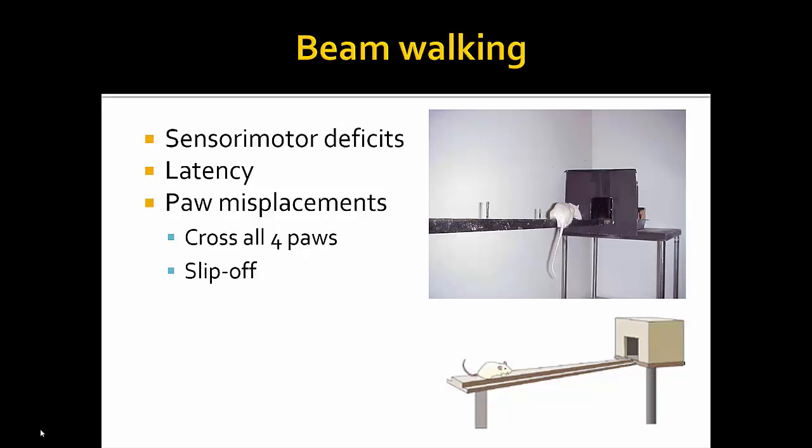When we do our experiments on a normal rat, we don't even have to train them; they just do it. We have a very similar arrangement. But when they got the motor disorder, they don't want to do it, even with big noise or something. So we were just wondering how. Even if we train them a lot when they're normal, they won't do it once the disorder is there. So that maybe depends on the severity of your disorder.